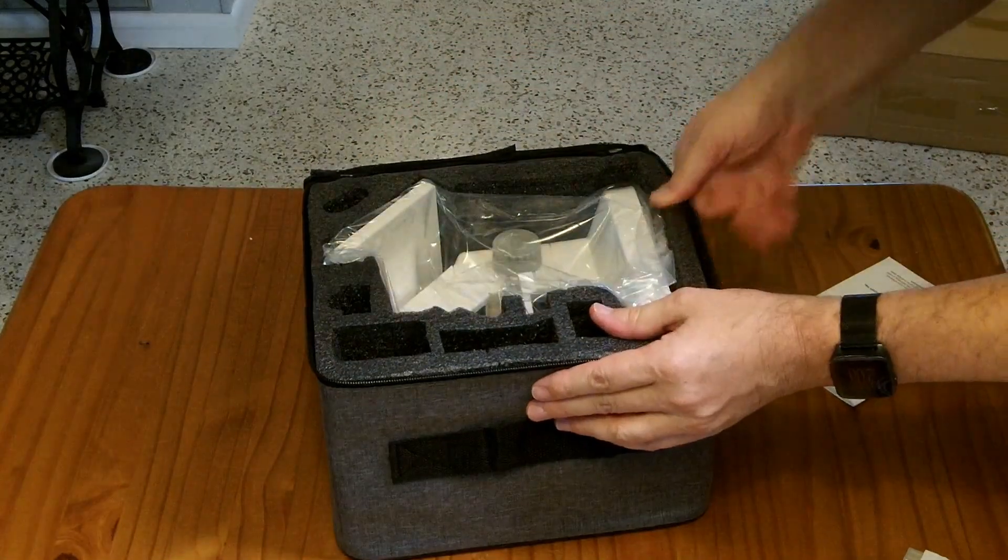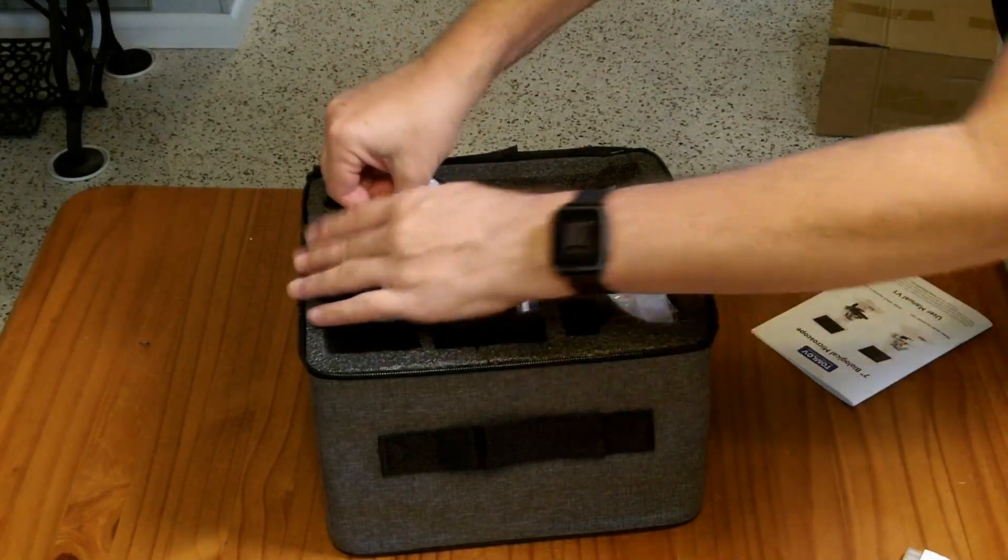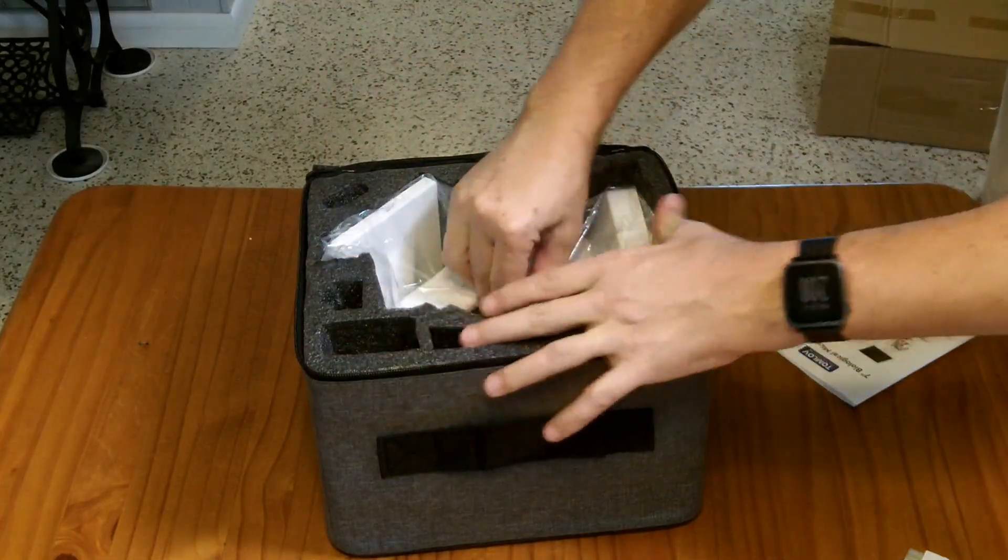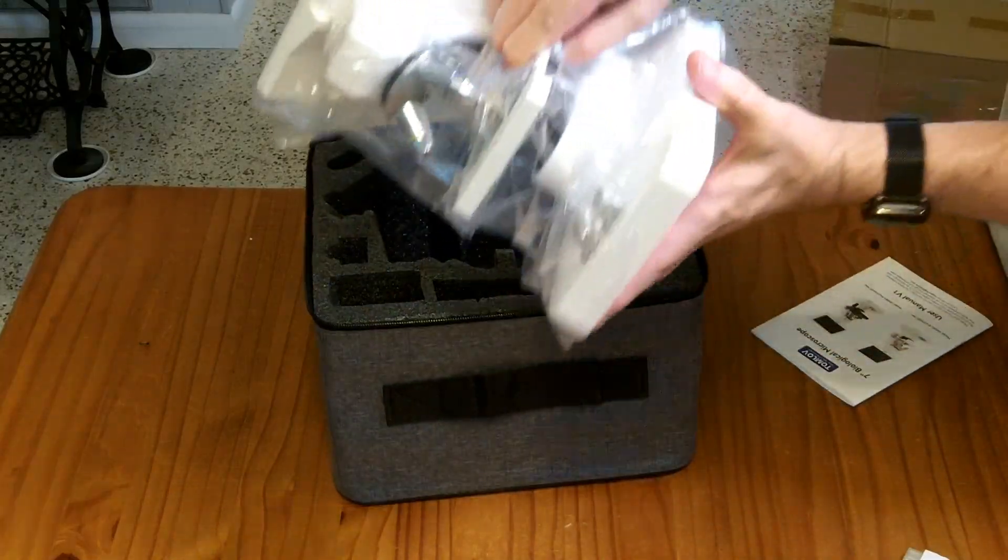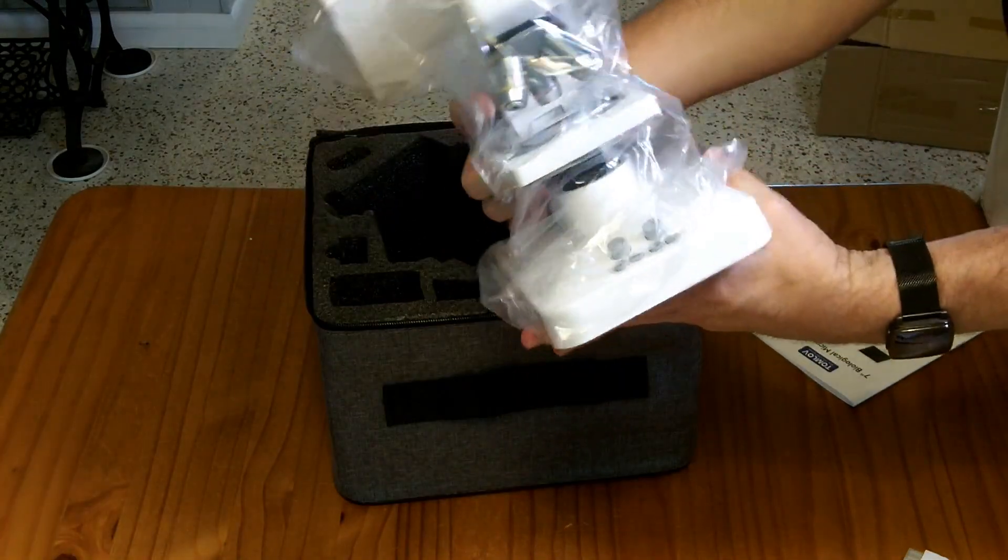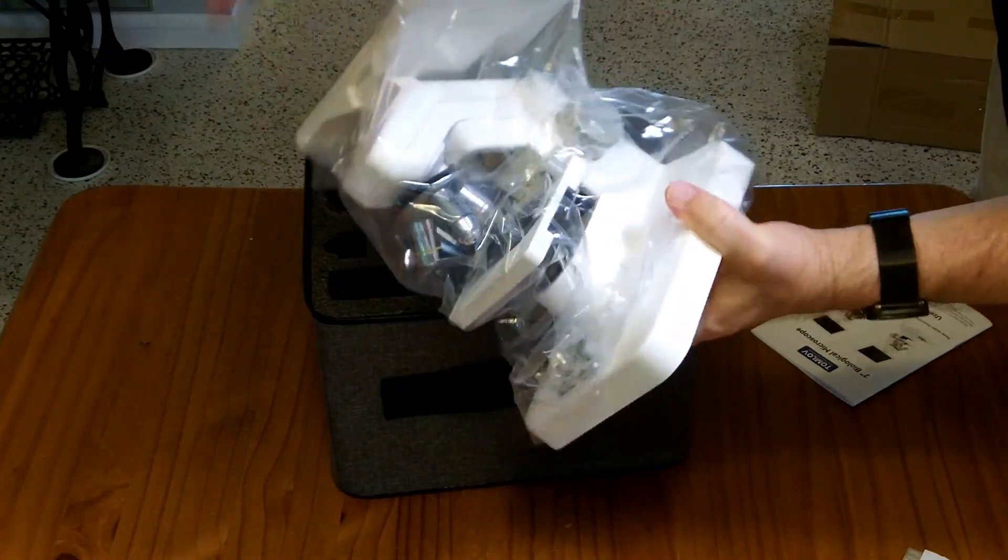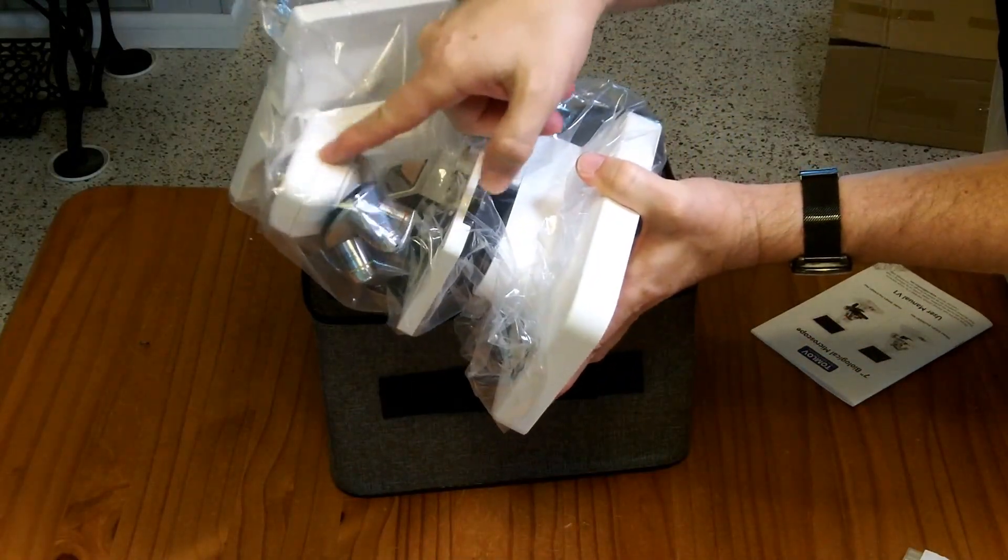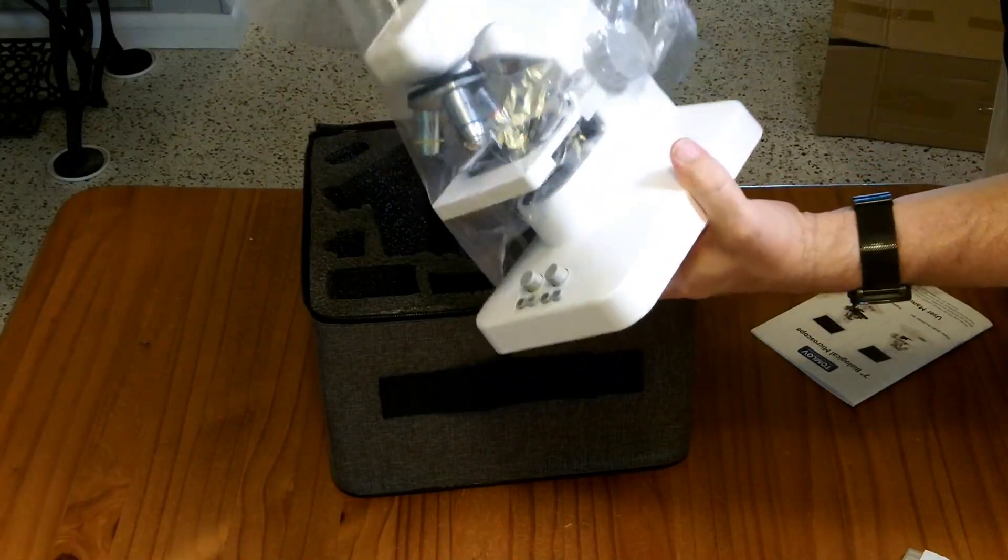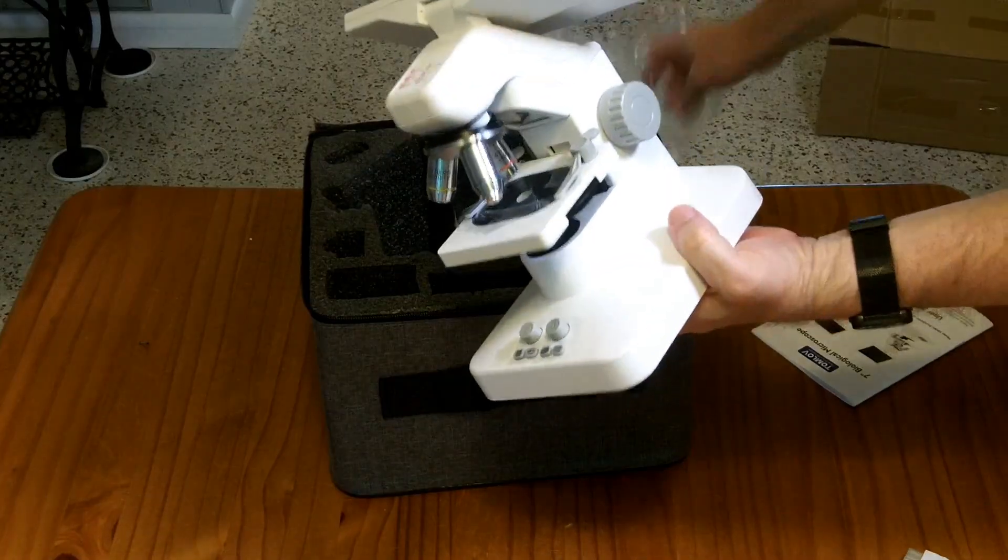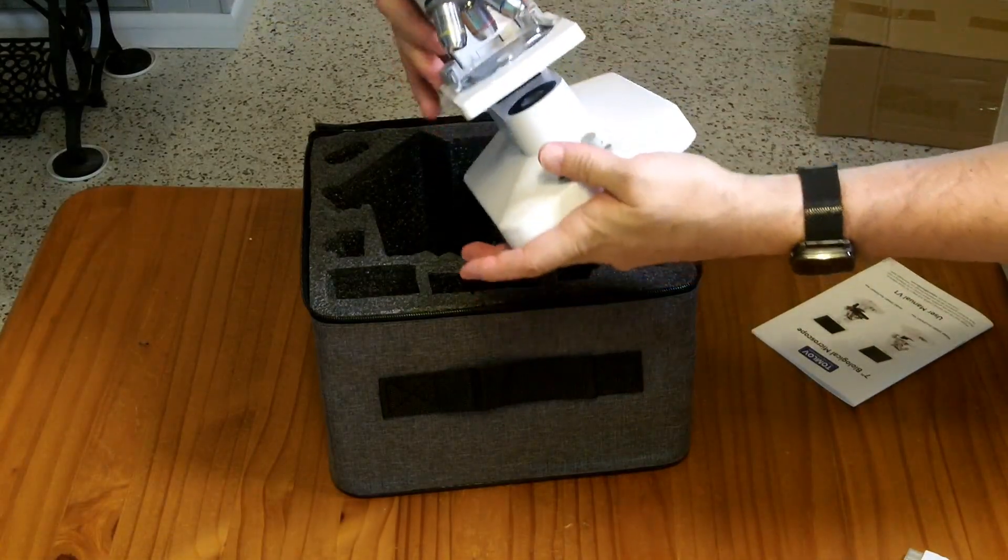And then we have the main microscope itself. There's this screen here and the microscope body. You can see here that the screen folds up, but the camera is actually down in there as part of the microscope. So this is not a microscope where you can put your own eyepiece on. It is only going to work through the camera and through this screen.